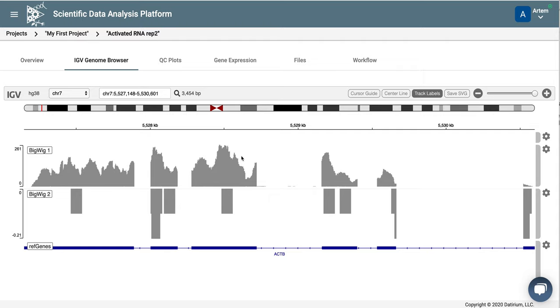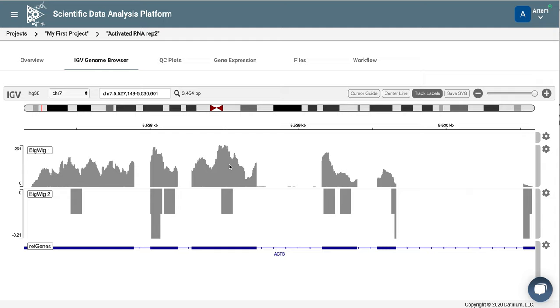And as you can see, this is a strand-specific or dUTP experiment, and in this case, you see the reads only on the top strand. If you saw the reads on both strands, it would mean that the experiment is not stranded, and you should analyze it with a non-stranded pipeline.